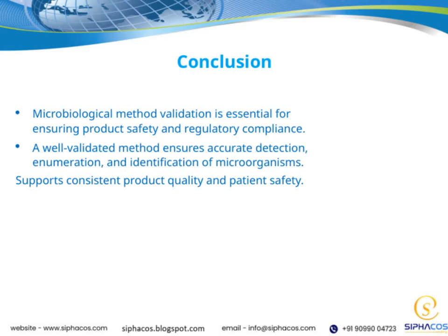Microbiological method validation is a crucial part of ensuring that our products are safe for consumers and meet all regulatory requirements. When we have a well-validated method, we can confidently detect, count, and identify microorganisms accurately. This accuracy is vital because it directly impacts the quality of our products and the safety of the patients who rely on them.